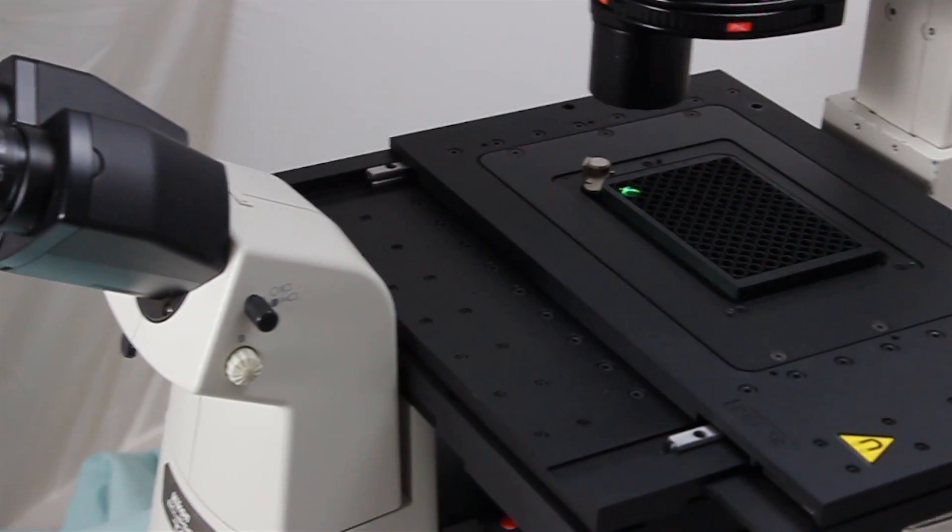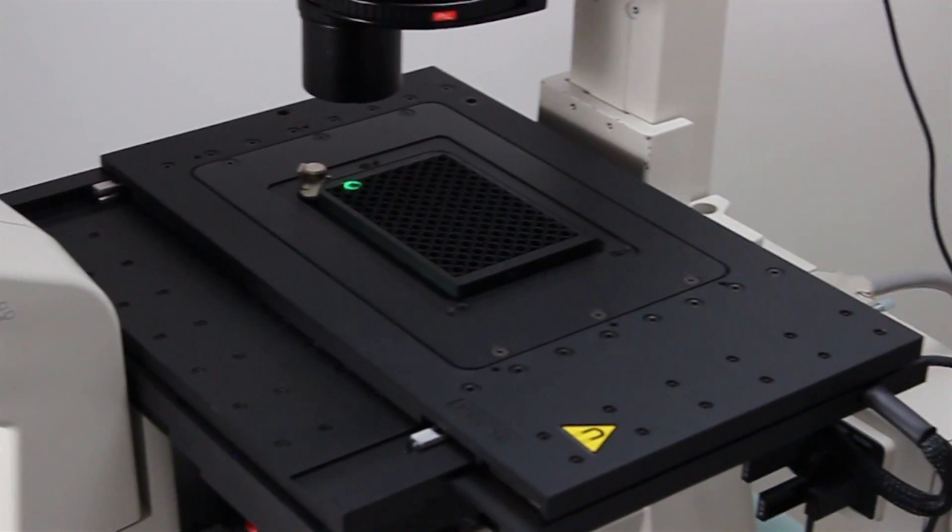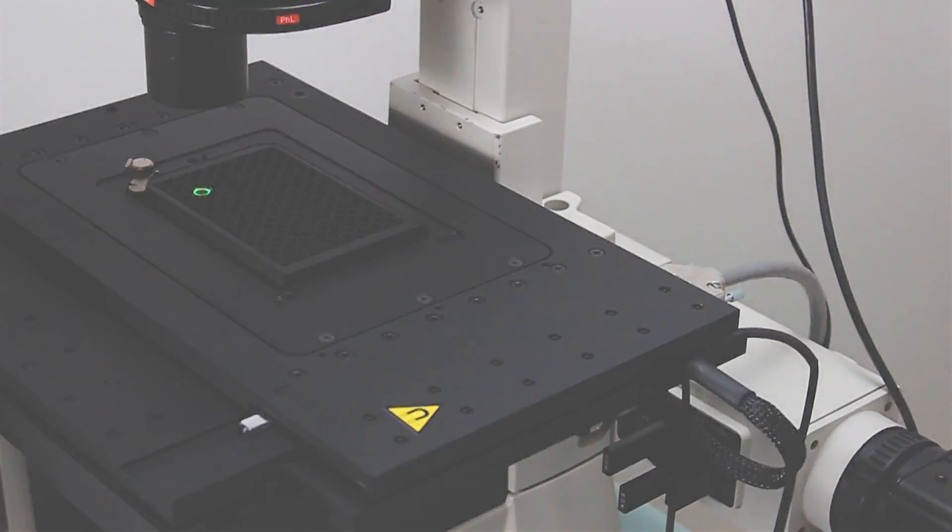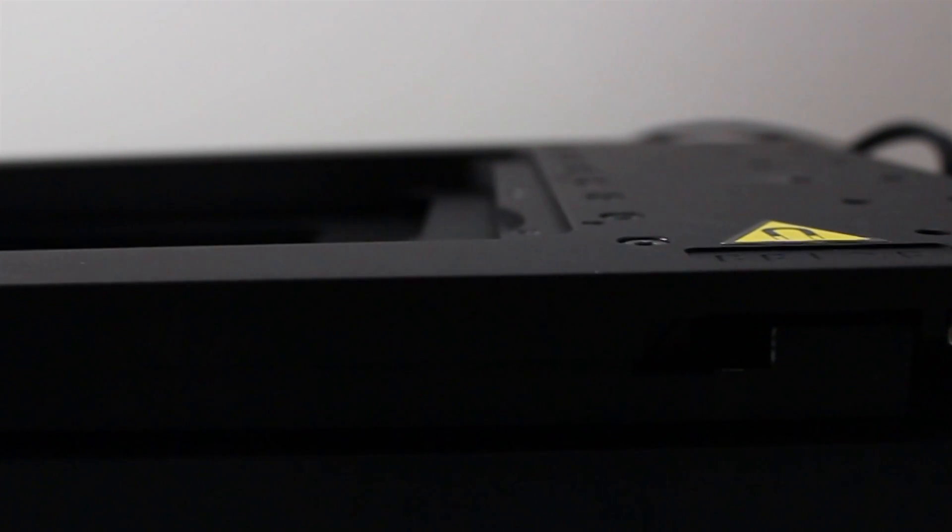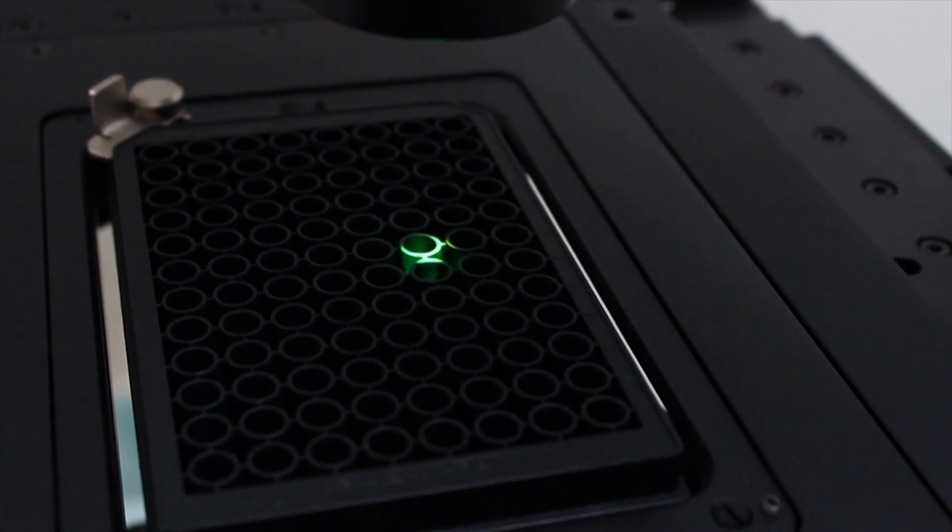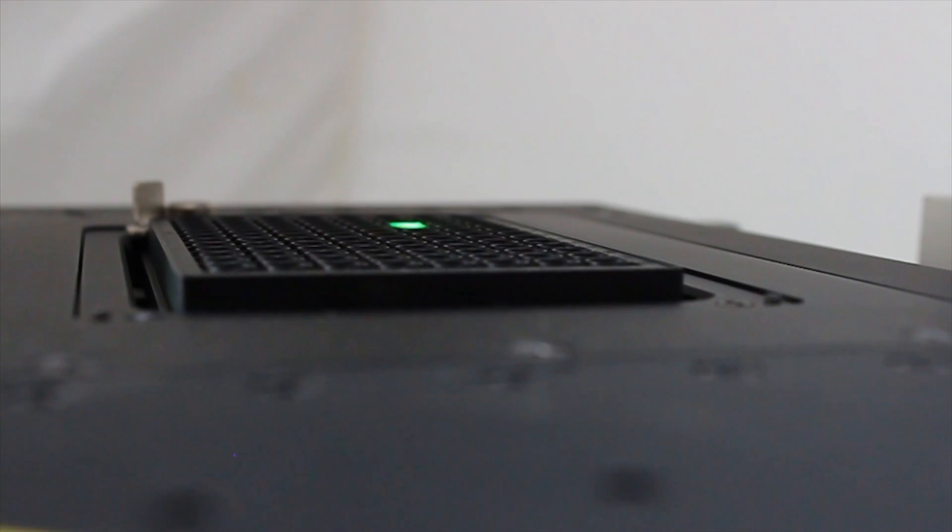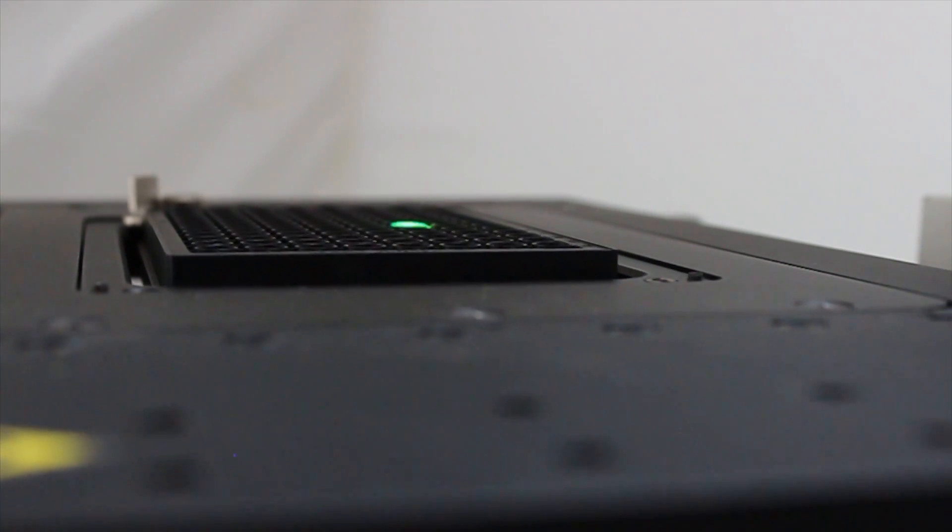Today's range of imaging applications require an enormous range of flexibility and control solutions. XY stages are a huge component of most any automated imaging system.